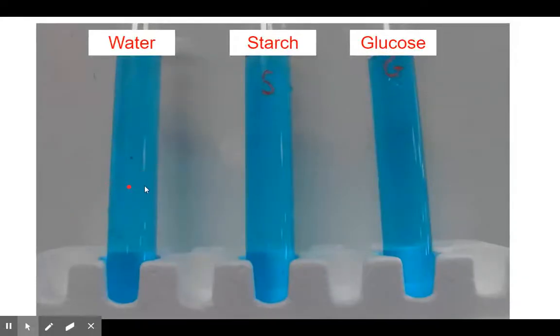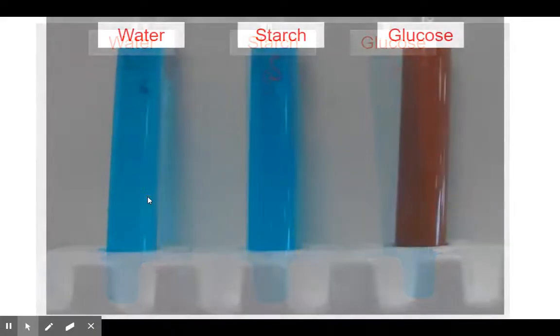You can see it's a lighter blue color because it actually got diluted by the other liquids. After we've heated it up for a couple of minutes, let's see what happens. And boom, it works, awesome.